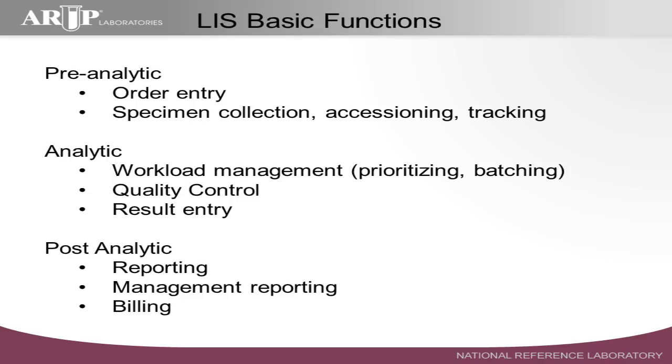Your typical LIS is considered a workflow type of information system. It is designed to follow the workflow of a laboratory, hopefully from A to Z, from beginning to end. And these are some of the features that we'll cover in a little bit more detail as I go through this.